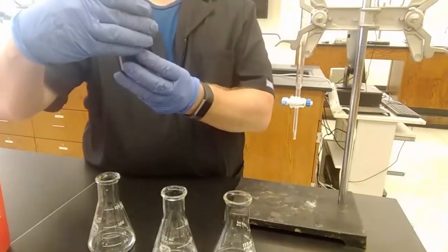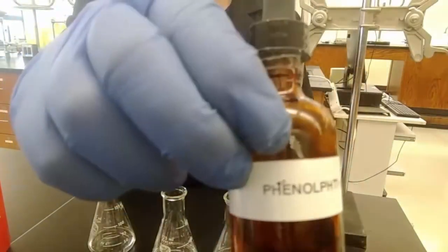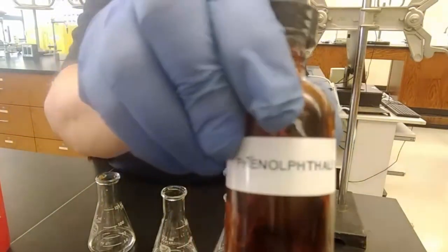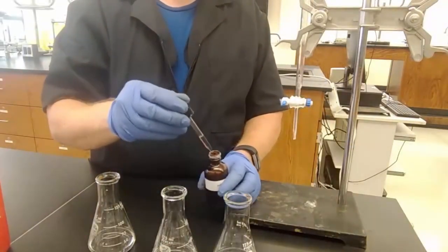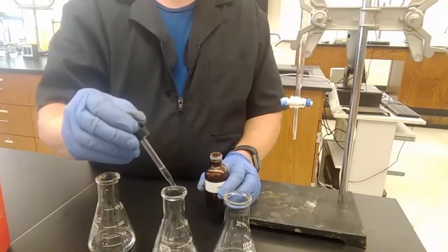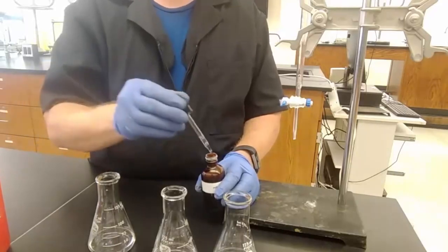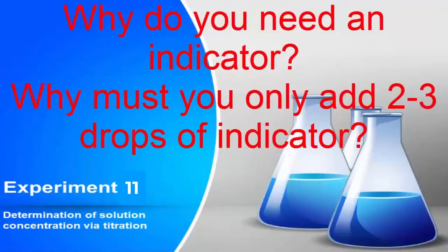Did they spell it right on the bottle? They did. It looks like phenolphthalein. But it's pronounced phenolphthalein. And we'll put in 1, 2, 3 drops. Why do I only add 3 drops?